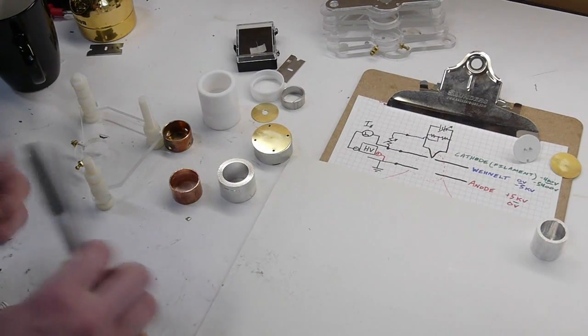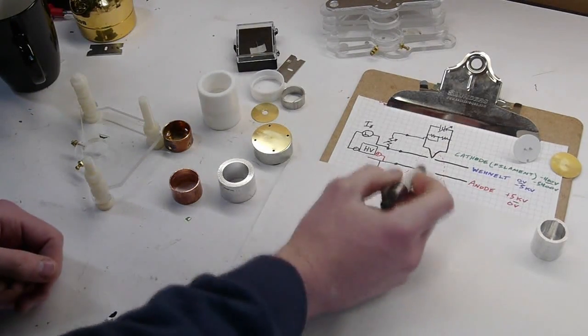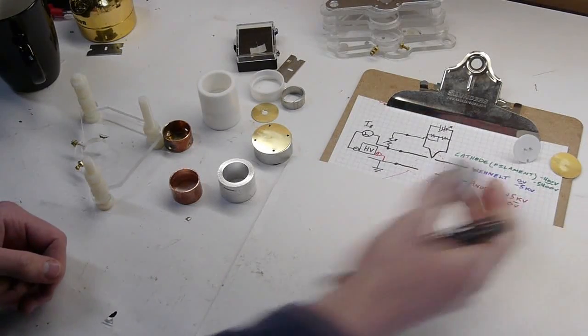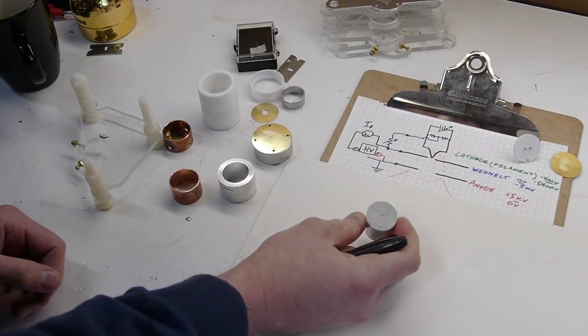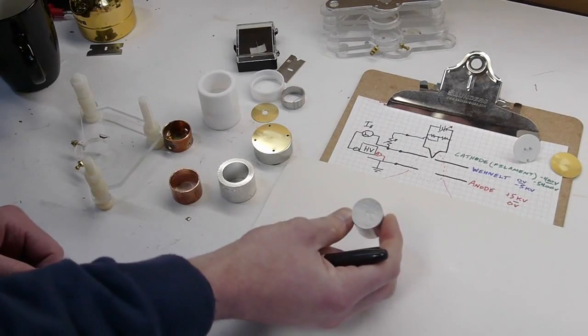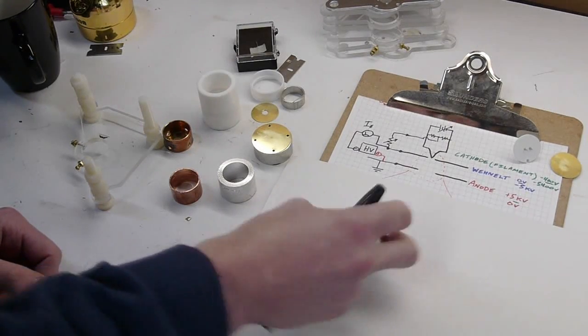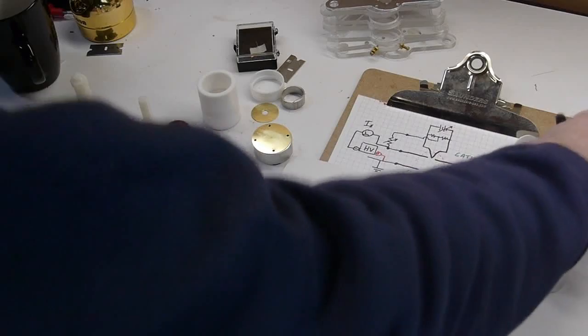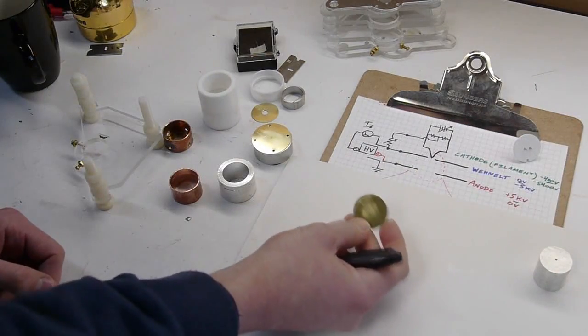And I'll try to give some dimensions here. So the hole in the anode is about, I think I settled on maybe one and a half millimeters.